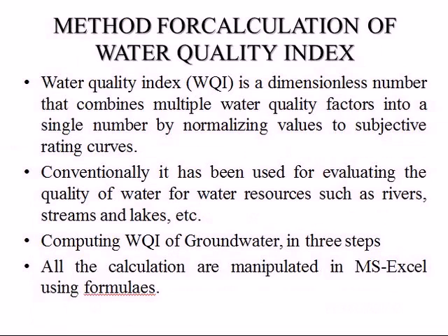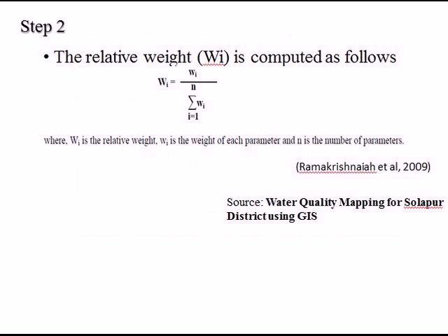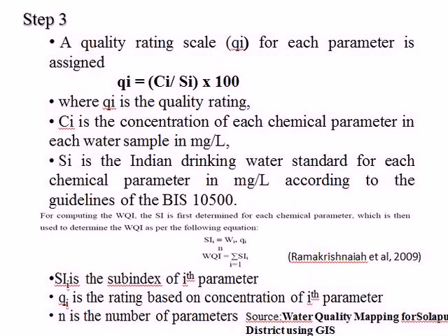The primary data is based on the samples we have collected around Minjur. The secondary data is based on the data we have collected, like relative weight of water quality index and drinking water standards. The samples were subjected to physico-chemical analysis using the standard procedures. Then reports are collected and analyzed. Then water quality index for the water sample is prepared and analyzed. Then we have implemented it in our ArcGIS software to get the groundwater quality map with the help of spline curve technique, which provides the mapping for groundwater quality index.